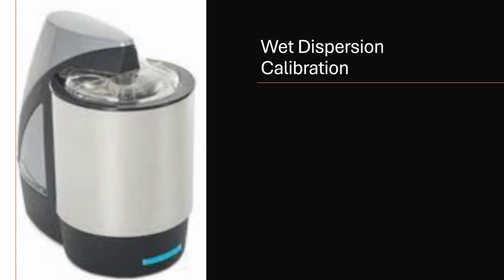So now first we will discuss the wet dispersion calibration. This wet dispersion calibration is applicable for liquid medium samples, right?